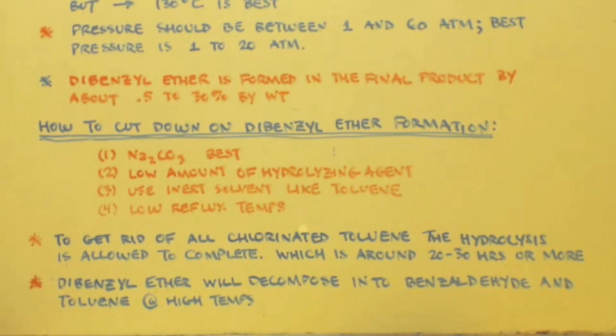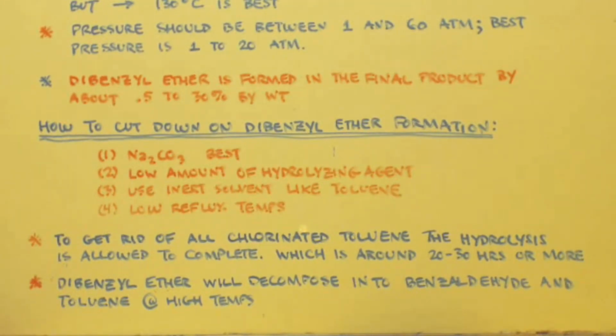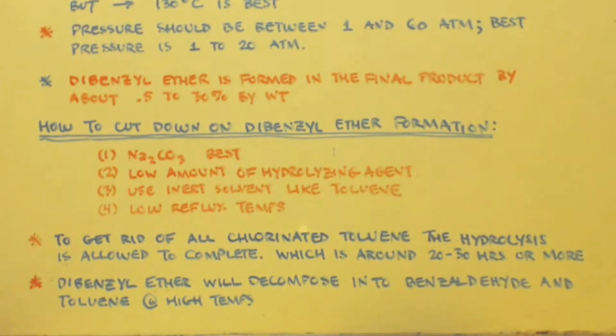Now, how can you cut down on this formation of dibenzyl ether? Well, there's 4 things you can do that would help. One is use the best hydrolyzing agent, sodium carbonate. Two, the lowest amount of hydrolyzing agent you can get away with. You know what I mean? That's why I said 1.1, or 10% in excess of the stoichiometric amount. Three, use an inert solvent like toluene, okay? And I'll get into how much toluene you should use. Four, low reflux temperatures. The higher you get up, at 180 C, sure, you'll be done with the reaction in a couple minutes. But if 30% of it is dibenzyl ether, it might not be that great of an idea to do it that hot.